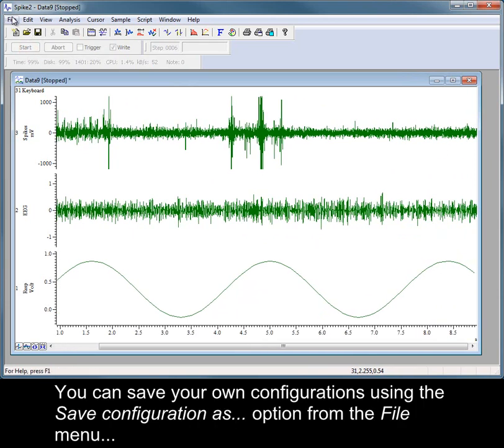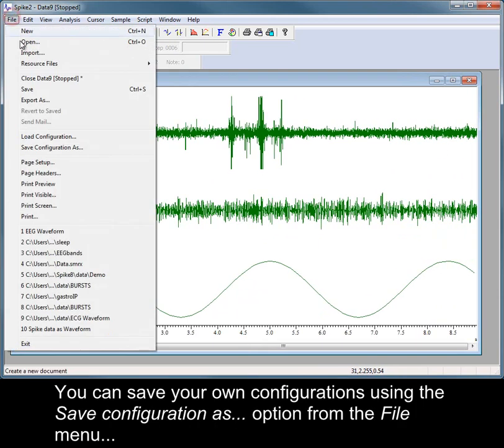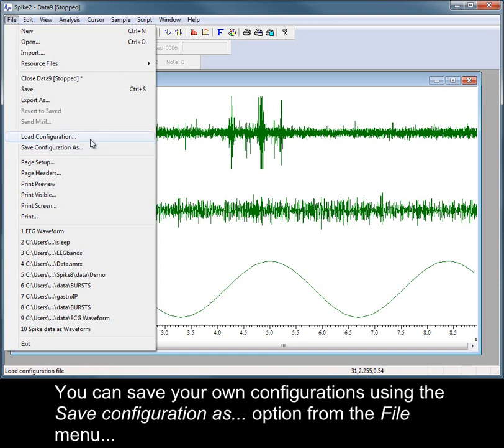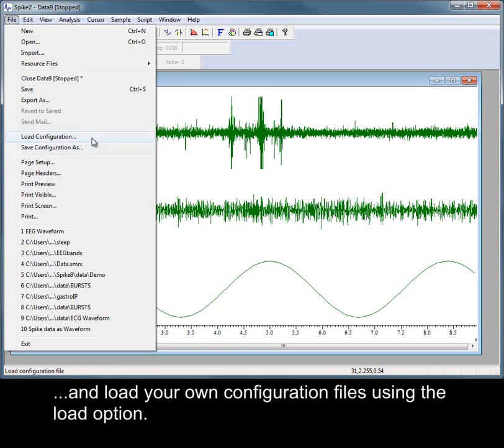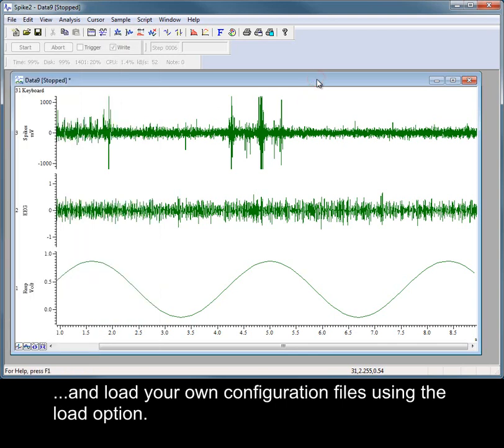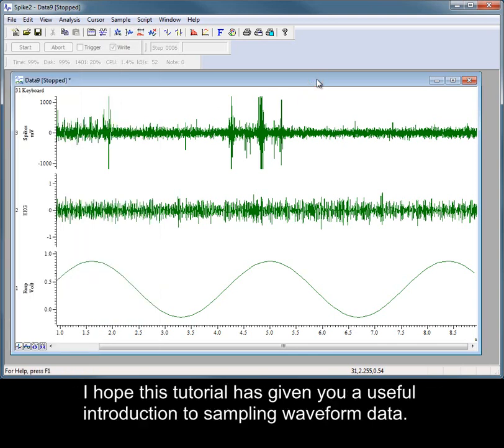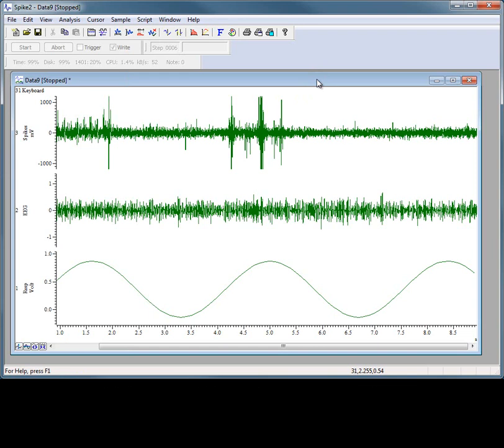You can save your own configurations using the Save Configuration As option from the File menu, and load your own configuration files using the Load option. I hope this tutorial has given you a useful introduction to sampling waveform data.